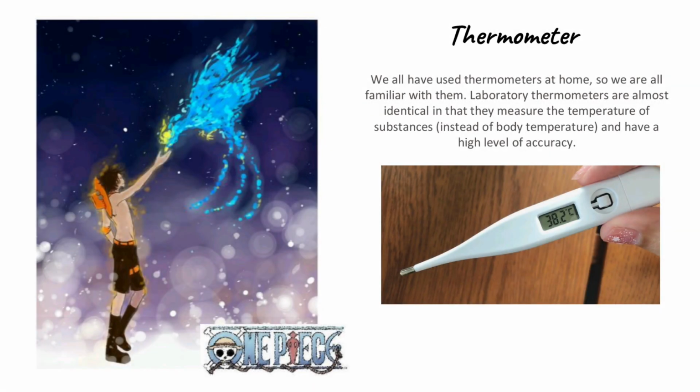Thermometer. We all have used thermometers at home, so we are all familiar with them. Laboratory thermometers are almost identical in that they measure the temperature of substances instead of body temperature and have a high level of accuracy.